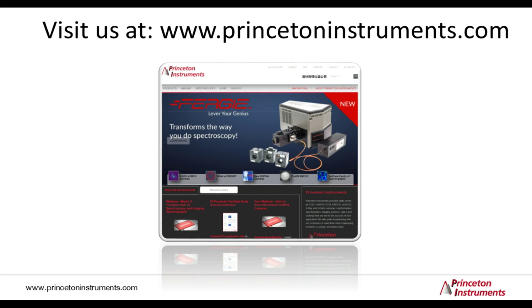How do you perform an intensity calibration?